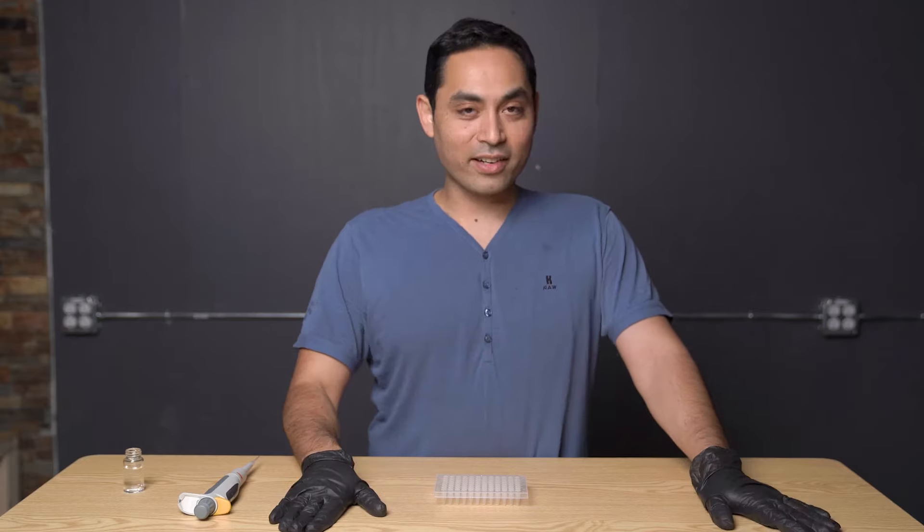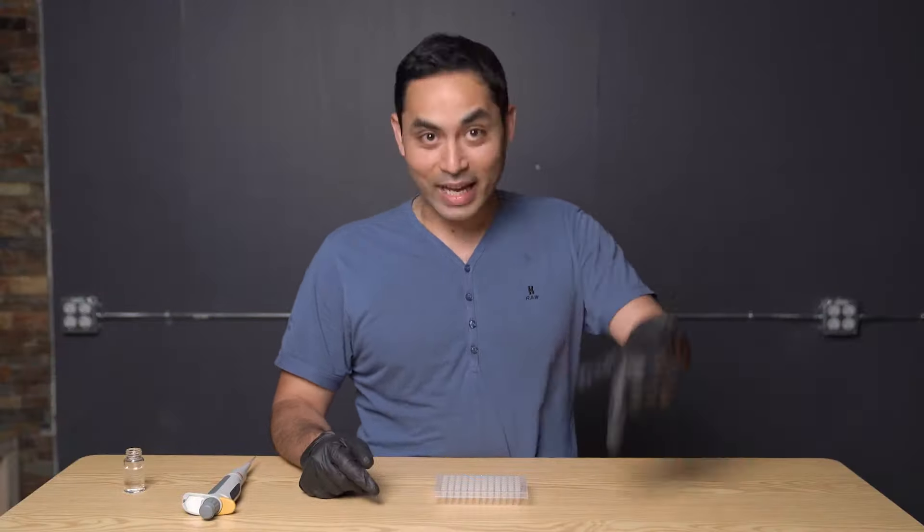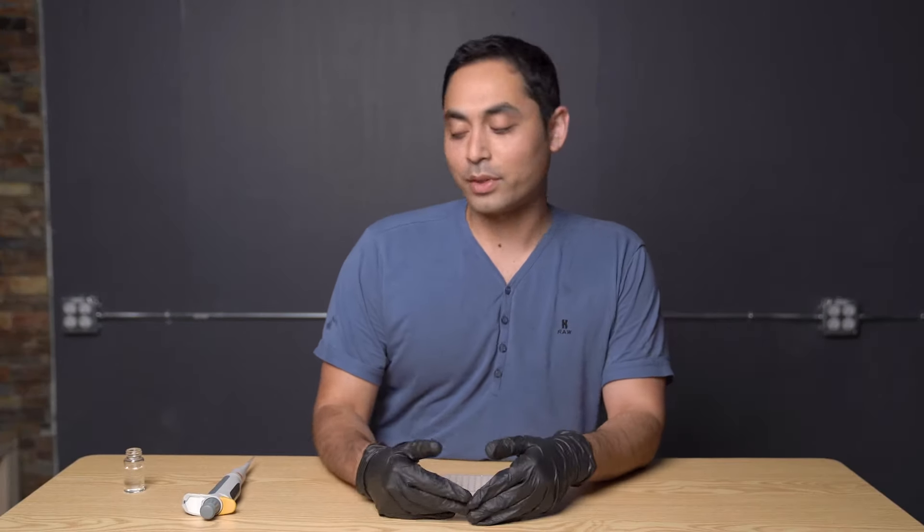The first thing you're gonna need to do is find some pipette tips. You couldn't get them during COVID, but now you can. So we're gonna go through how to pipette properly so that you're getting the most accurate results.